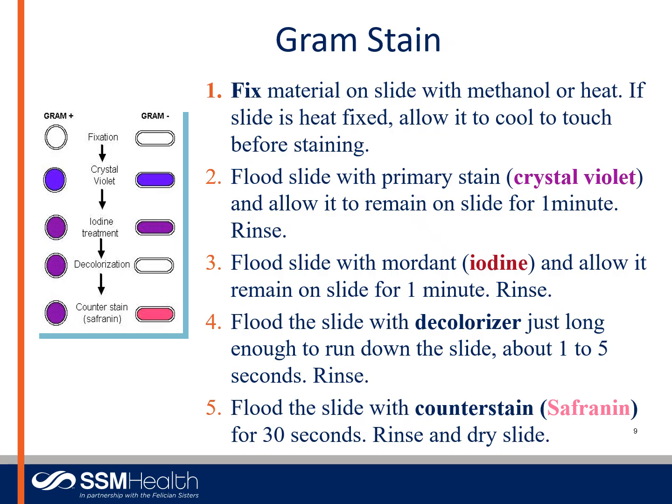Then you flood the slide with mordant, which is your iodine, and that stays on the slide for 1 minute. And that, once again, that mordant binds the stain to the cell wall. After 1 minute, you're going to rinse that again with tap water, and now you're going to add your decolorizer. It says flood the slide, but really what you're doing is just allowing that decolorizer to run down the slide for 1 to 5 seconds. And it really depends on what type of decolorizer you're using. Acetone's very strong. 1 or 2 seconds is plenty.